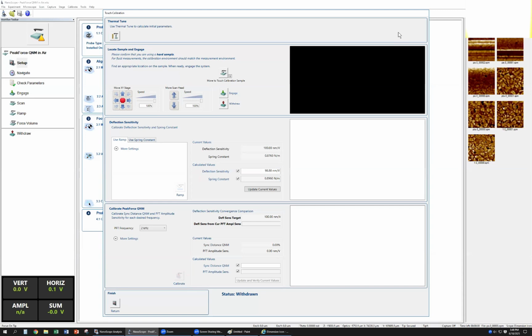Okay, I think I use the sample. 你没有这个第8号样品。Okay. Then we just use this 41 40 RA. So this 40 is a little bit soft probe because this one is only 0.8, right? So it's a little soft probe and we load them.